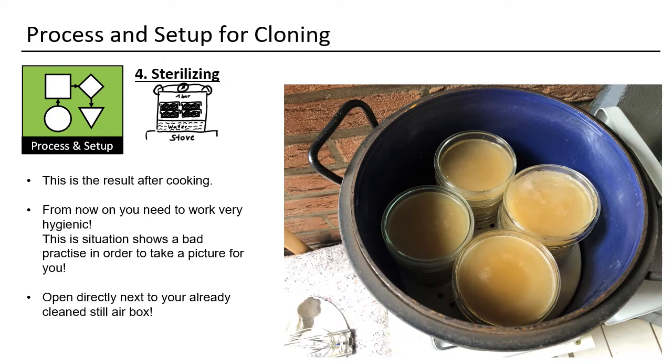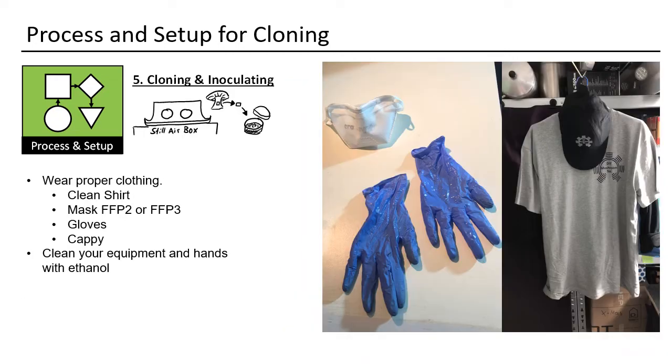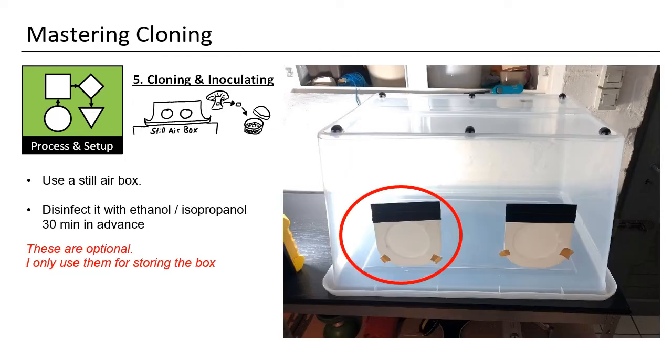From now on you need to work very hygienically. Wear clean clothes. Use an FFP3 mask. Wear gloves and a cap. Disinfect your hands with ethanol. Use a still air box to do the inoculation.